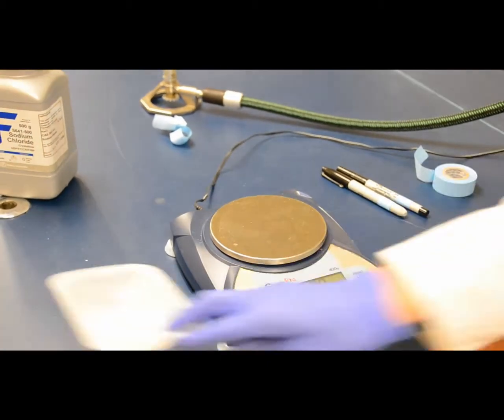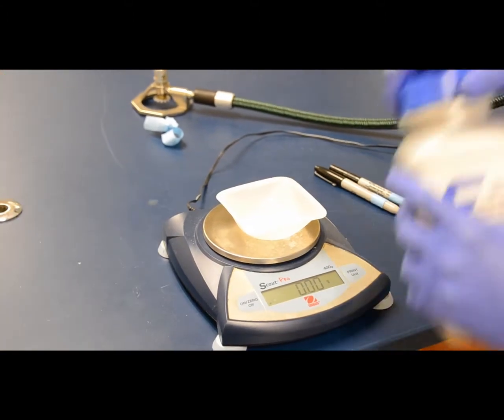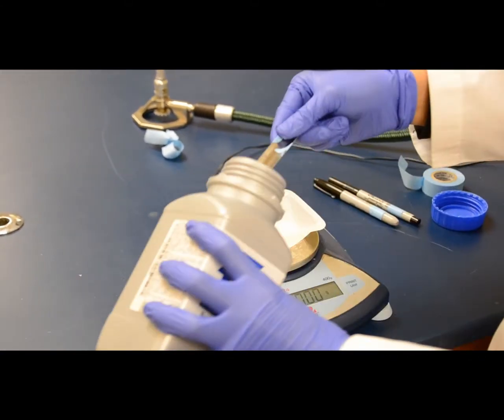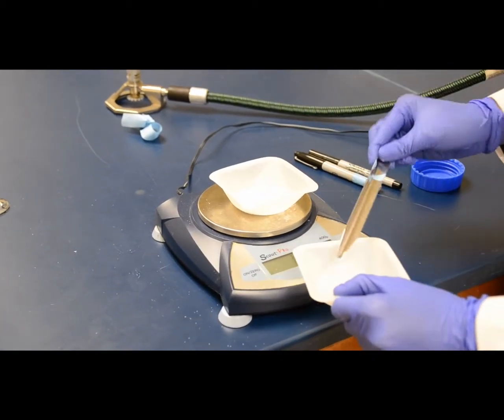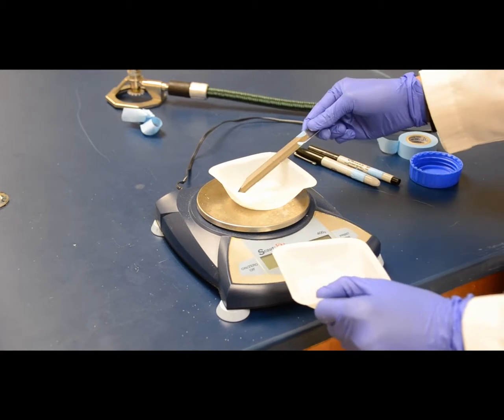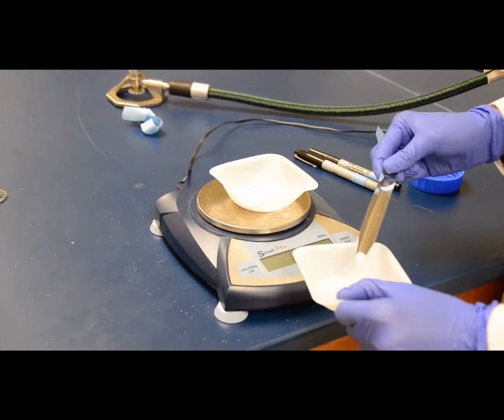Place a weighboat on the balance and hit the button that says on/0 to 0 or tare it. Now you may take your scoopula, open up the container, and weigh out your solid. If you add too much, do not put it back into the original container. Place the waste into a different weighboat and discard. Go carefully to minimize these occurrences.